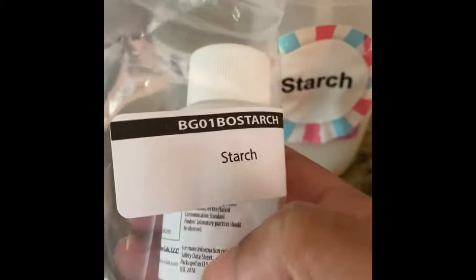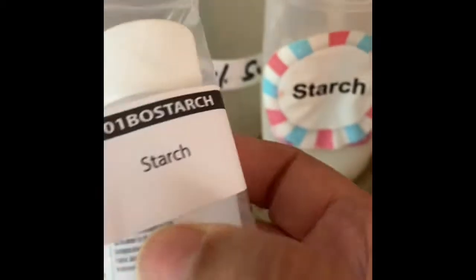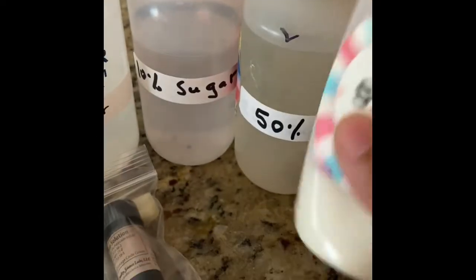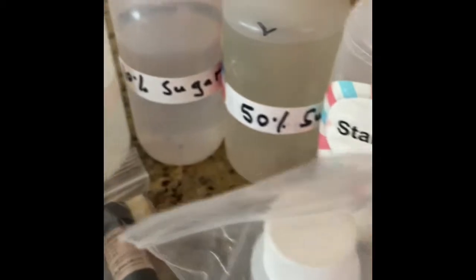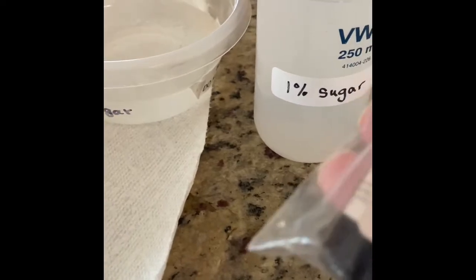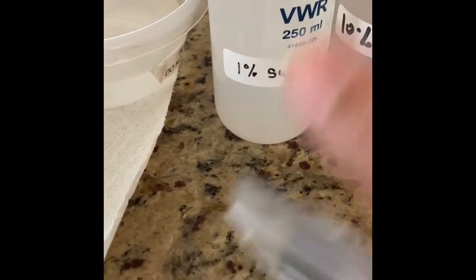If you have the lab kit from biotechnology, from a chemical lab, if you order it, it looks like that. This one I just ordered from Walmart, but it's a starch. And we have iodine solution. You have it also if you order it from a lab. Sometimes the color of iodine is a little yellowish, sometimes no color at all, right?